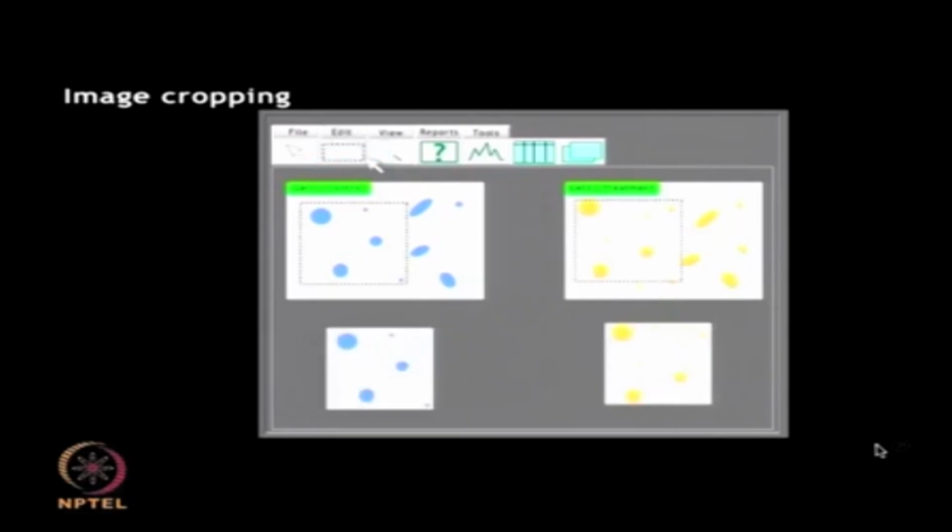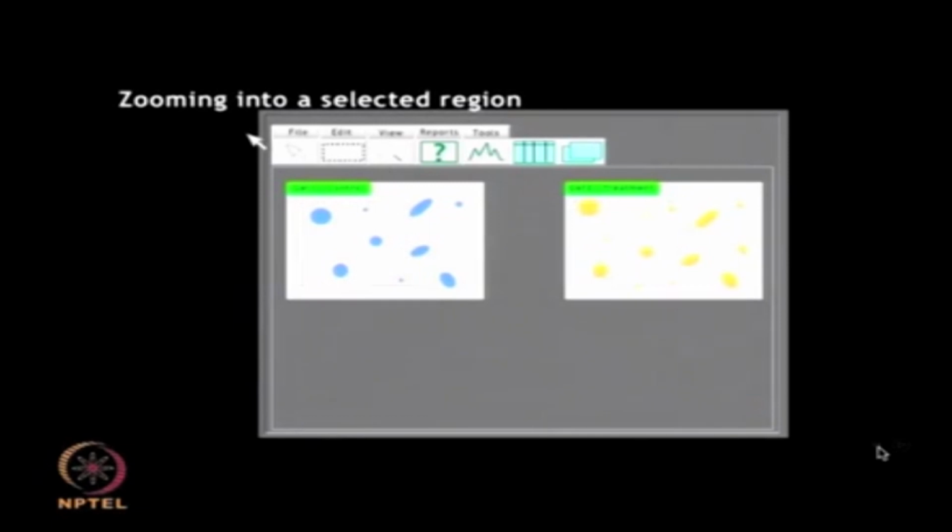You can save the gel images and then you can crop the area depending upon what area you want to analyze. There are several tools which are available for the analysis of gel. It is possible to crop the gels by selecting a specific region that is to be studied and then selecting the crop gel function. Cropping gel helps in selection of a region with high spot density or to remove the regions which contain high background stains with no spot.